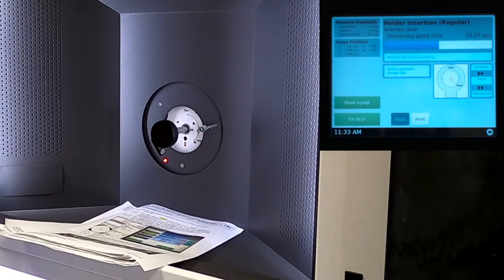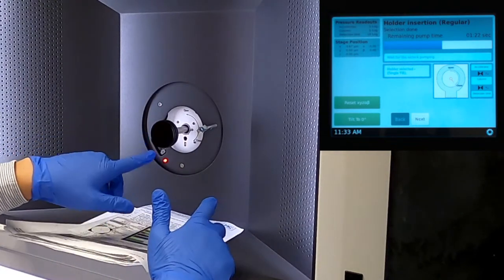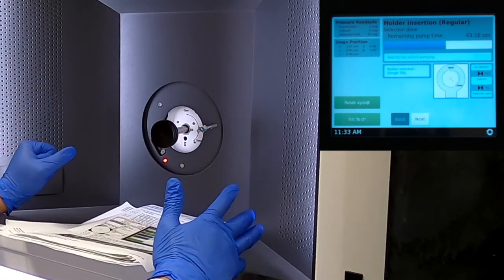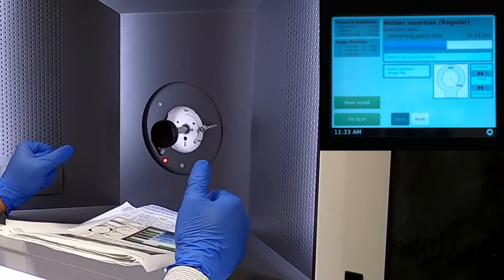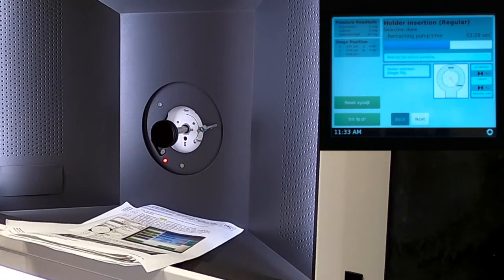I know probably in this video you cannot see the marker and the pin to explain those small things very clearly. Don't worry, we can also cover that in our second training. The pumping time is 3 minutes. Do not try to change that time. You can just wait here for 3 minutes and let it finish pumping.